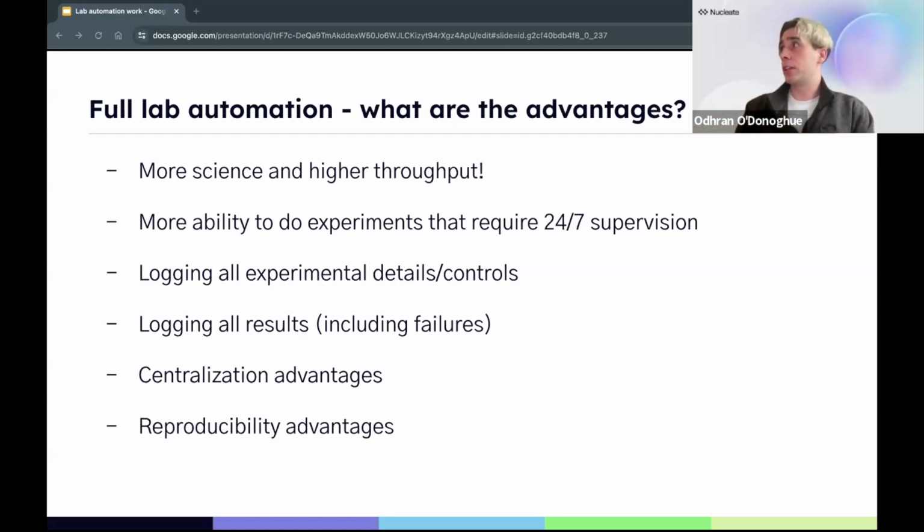On top of that, one thing that's really interesting about having experiments run by robots is that, in theory, we log everything. All those little things you forget in the protocol, like what the temperature is, what the atmospheric pressure is, what the humidity is, what time of day it was, these things ultimately can affect the actual experimental results. We do that on a computer, we do that with robots, we can log everything. Similarly, we have all those results logged, including the things that went wrong. This is really informative in theory for allowing us to iterate better and better at doing science.